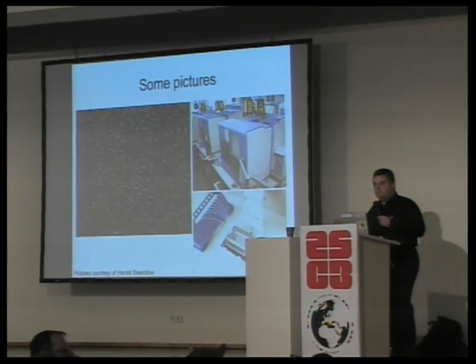And if you do 30, let's say 35 bases, which is the one end of these fragments that we made previously, you will have to photograph this entire flow cell in this high resolution 35 times. And if you do what they usually do now, you do so-called paired reads. So you take both ends of this fragment. You have to do it 70 times.